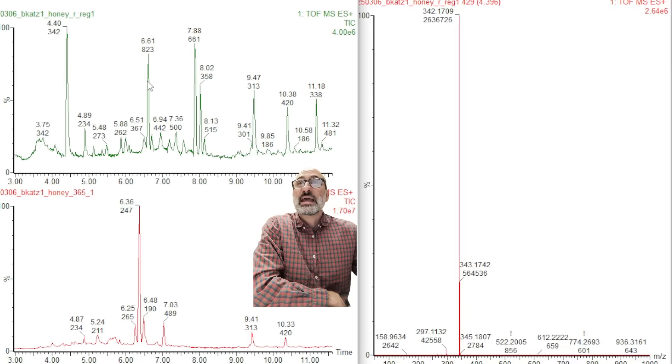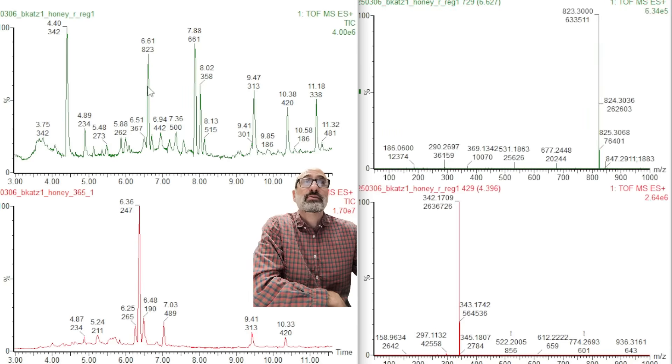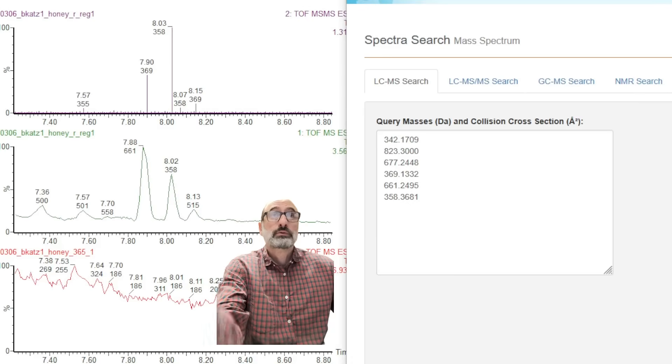We have this 823 mass, which has kind of that characteristic breaking product of a glycosylated molecule. So some sort of plant-derived molecule. So this one I'm kind of hopeful is plant-derived. This one definitely looks synthetic.